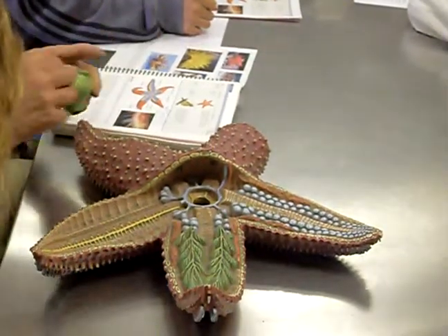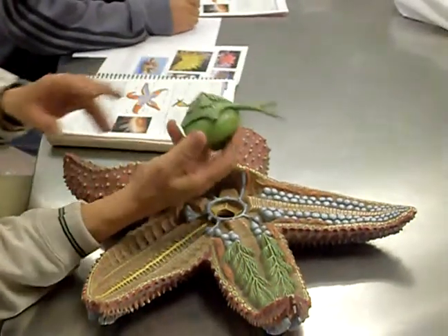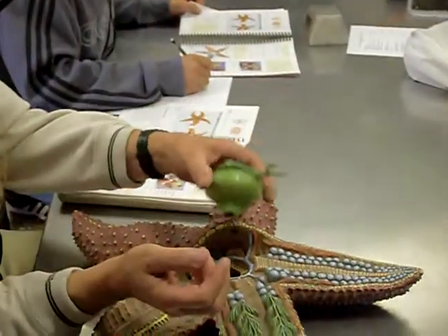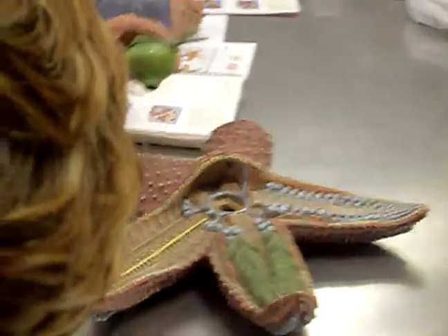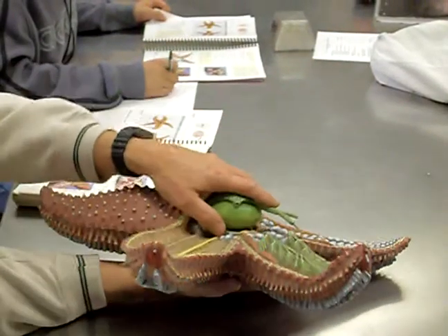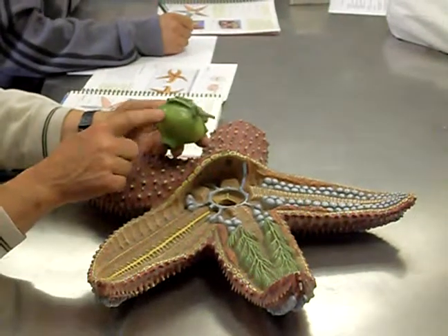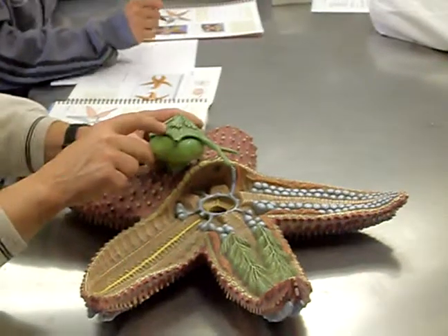As far as the digestive system goes, the mouth is on the underside. Then we have two stomachs. This smooth one is known as the cardiac stomach. This is the one that can come out through the mouth and turn inside out — it can extend out and into a clam shell, or if feeding on coral, spread the stomach out and secrete digestive enzymes to digest away whatever it's feeding on. The food goes in through the mouth into the cardiac stomach, or the stomach comes out and takes the food in. Then it goes from the cardiac stomach to the second stomach, called the pyloric stomach.